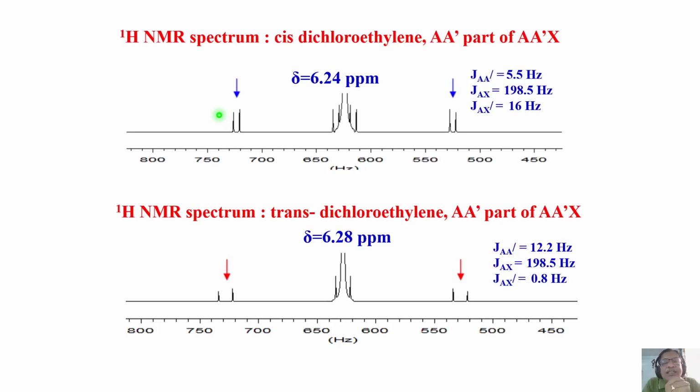So in this proton spectrum, I must see the coupling of proton with carbon. Where will these lines come? You can split the proton into a doublet of very small intensity, 1% compared to the main peak, on either side. Because it is very small intensity, nearly 1% of the main peak, they are called satellites. Satellites come because of the very low natural abundance of the coupled spin. You can extract coupling information from that also. We'll go more into satellite analysis when we come to different types of spectra. But here I just wanted to tell you, these two are called satellites because of coupling with carbon.